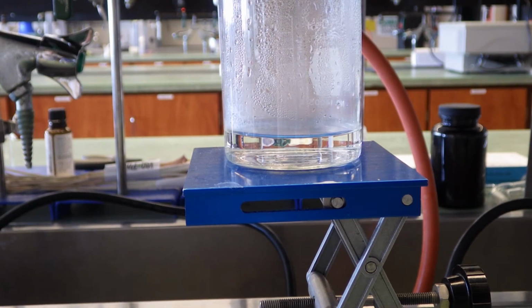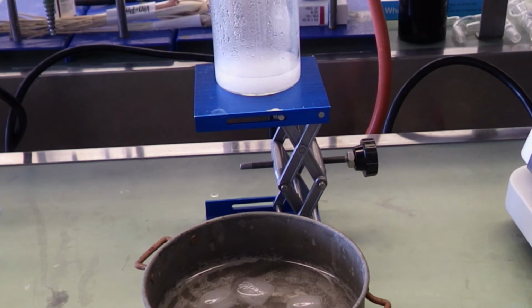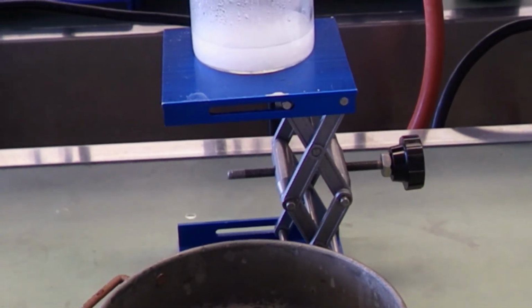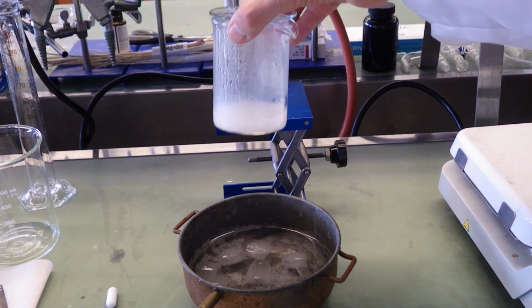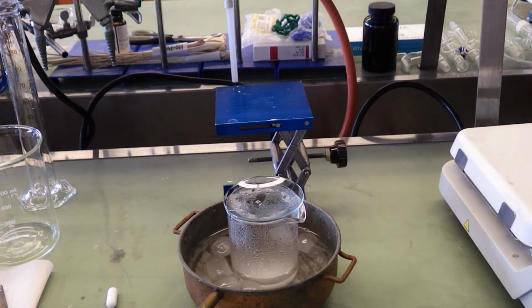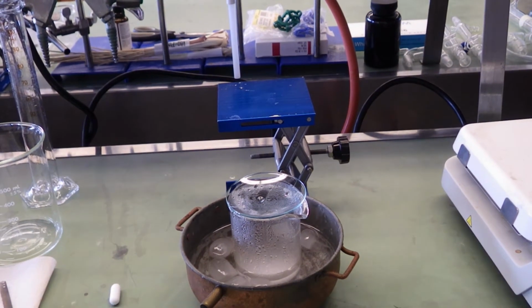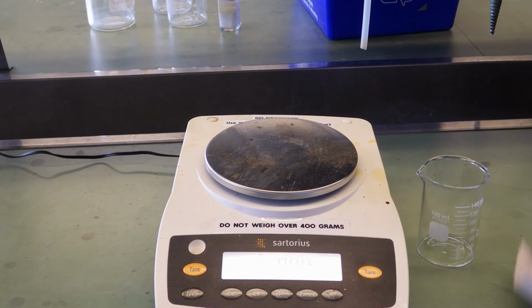So it sat at room temperature for a bit, and now we have some crystals. We'll maximize our yield by putting that in an ice bath for about 10 minutes. And this is a good time to weigh up our beaker and filter paper for our final mass.